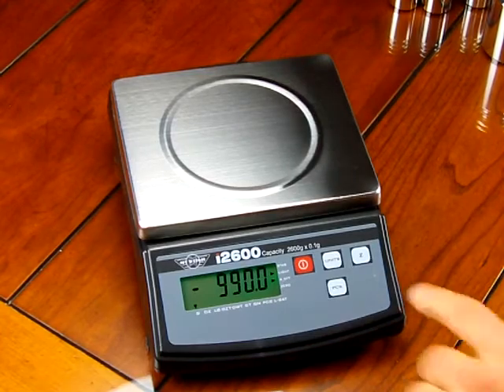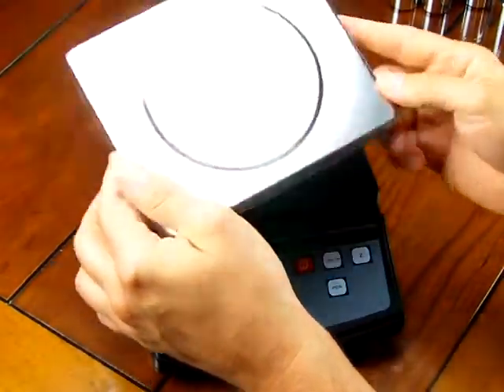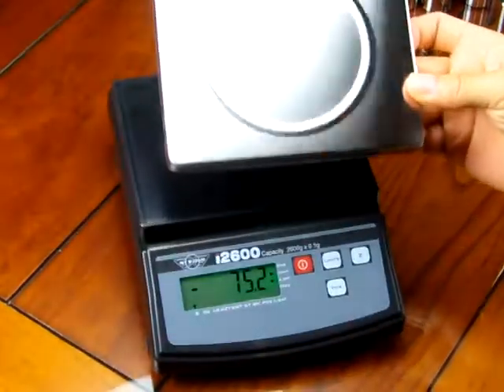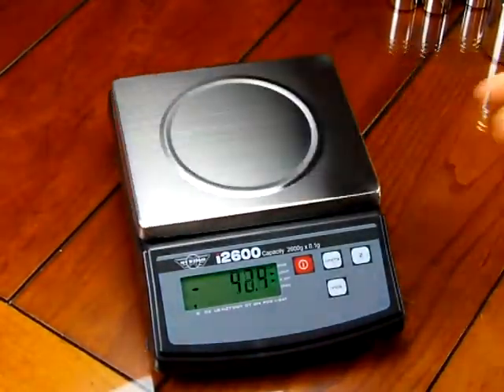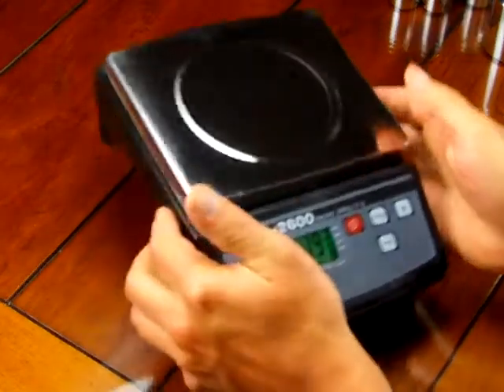The scale also offers a stainless steel removable platform for easy cleaning. That's a nice feature in the laboratory — to clean up your scale after doing preparation of a solution. If you ever have a spill, it's easy to clean.